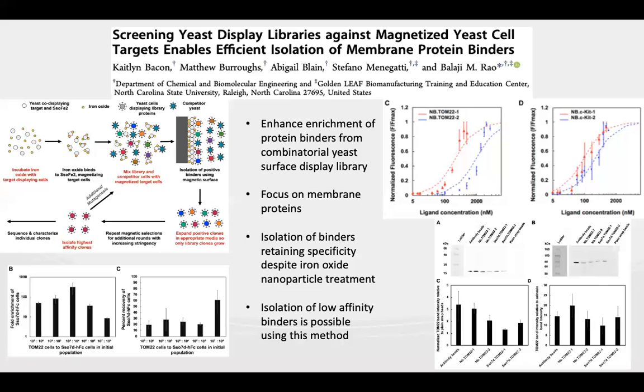Importantly, they wanted to examine nonspecific binding using this method. The construct that was chosen contained an F2A ribosomal skipping peptide, which when cleaved can reduce the hindrance of binding caused by its presence at the C-terminal end attached to the CMYC.